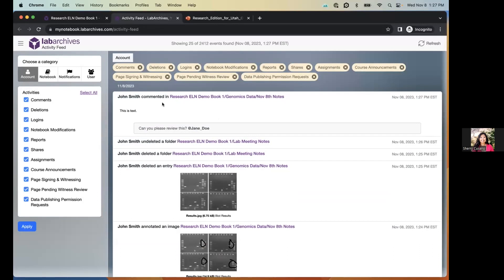They can view notifications by clicking the bell icon or by going to the triple-dot menu and selecting 'Activity Feed.' The activity feed shows everything happening in your account — a great tool especially for notebook owners to see what other individuals are doing without paging through the entire notebook. All activities are organized into four categories with further filters to customize what's shown in your feed.